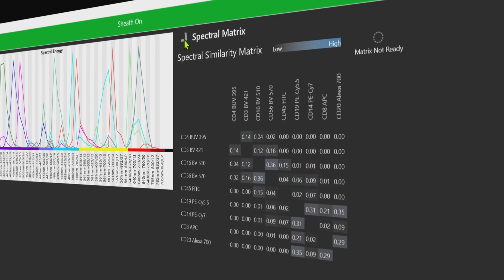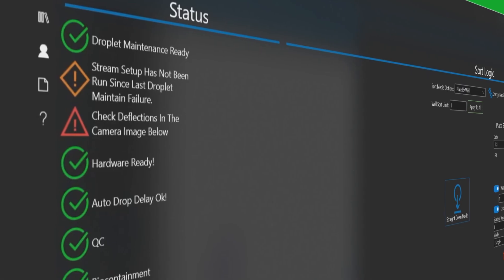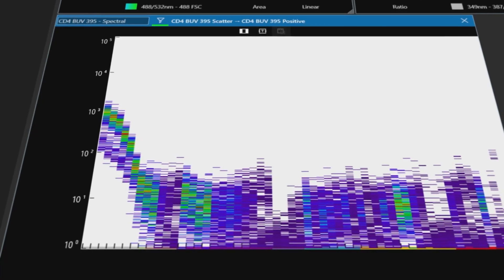The experiment wizard assists with running controls, identifying potential issues, and applying the unmixing algorithms to produce high-quality data.